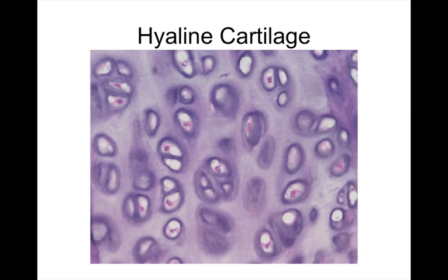All right, on to the cartilages. This is your base model of cartilage. So walk me through hyaline cartilage. The white spaces that you see are the lacunae where the chondrocytes live, and normally below you would see pseudostratified columnar cells. If we're looking at the trachea, yes, but if this were part of the growth plate of a bone, then we wouldn't see that. So this is a typical thing where we see massive extracellular matrix without a lot of fibers, without much space. This is just those proteoglycans and hyaluronic acid and stuff like that in the hyaline cartilage. Okay, so this is the base model.